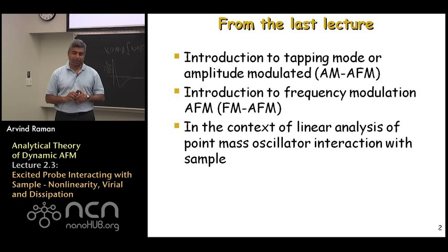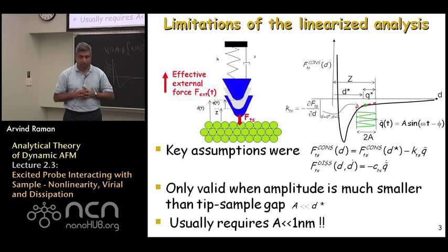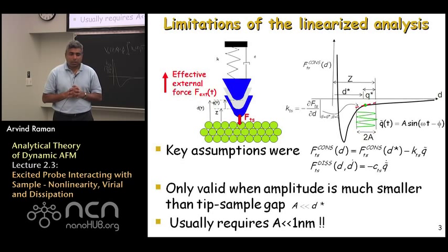So today we're going to expand that definition a little more, and talk about how to start thinking about both tapping mode and frequency modulation AFM without requiring this constraint of linearizing the equations to understand the physics of image formation and the material contrast channels.